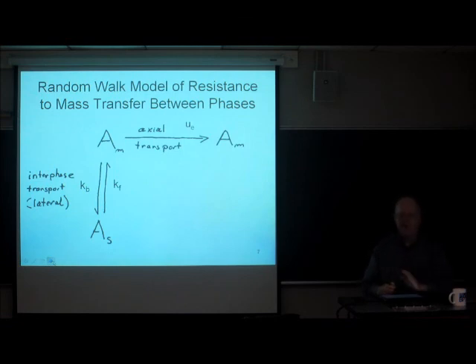This is another way to talk about that same problem. I sort of like this picture. So here's your analyte molecule, and it's in the moving phase. And when it's in the moving phase, it's subject to axial transport by convection. Because the fluid, the moving phase, is moving, it's being transported. And it's being transported down the column by the flow of the mobile phase. If you want, you can think of the solute as being pushed down the column by the moving fluid phase, be it a gas or a liquid or a supercritical fluid.